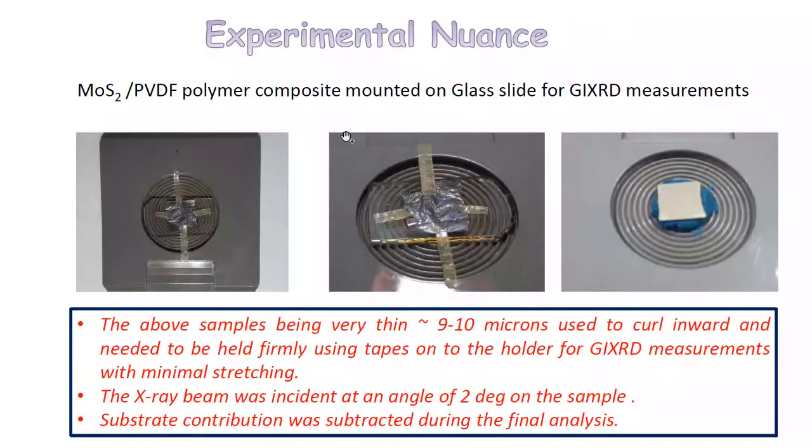It was a sample brought by our colleagues from the Kalpakkam node. They had very thin samples. So Rajesh, who has been making semiconductor detectors, has the patience and finesse that he was able to successfully mount the samples without them falling. Because anything we present, we always cross-question the results of the experimental scenario, he came up with several types of mounting arrangements. And then he was able to do the measurements at a very small angle. So, as I said, this is what we tried to do.